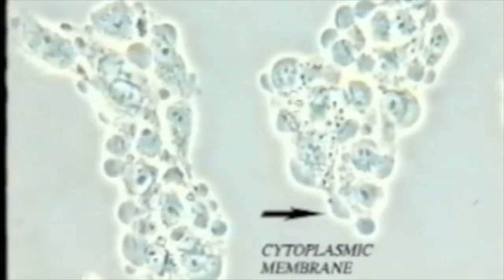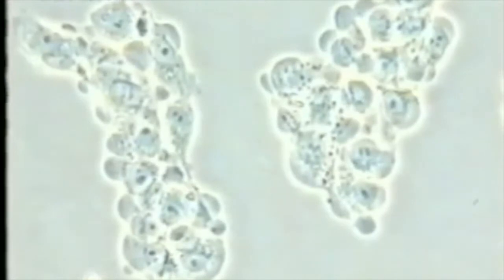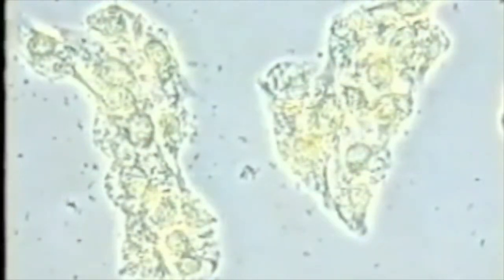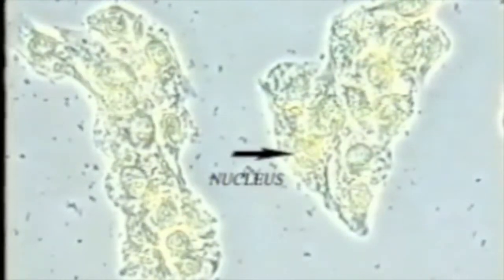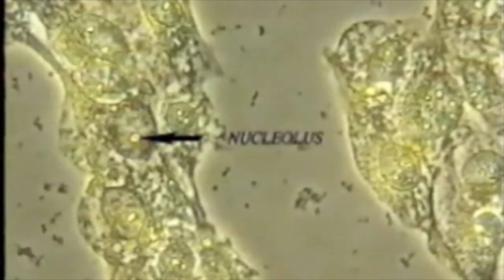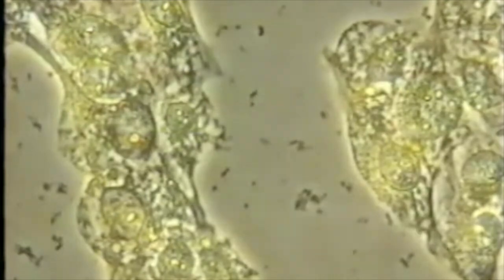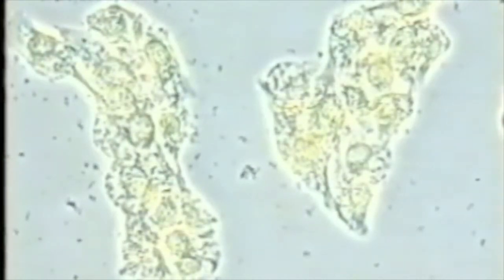Blisters appear along the cytoplasmic membrane and the cytoplasm swells. Under visible light, the characteristic yellow color of PB100 may be seen traveling across the cytoplasm, which becomes less homogeneous. After 30 minutes contact with the anti-cancer agent, nuclei of some cells are already yellowish in places, and nucleoli are stained pale gold, showing where PB100 concentrates. Cytoplasm is very slightly stained, but its organelles remain colorless.